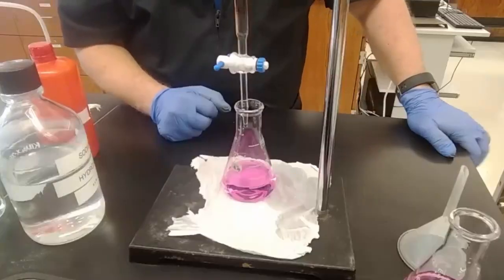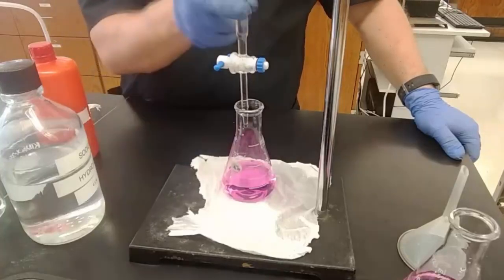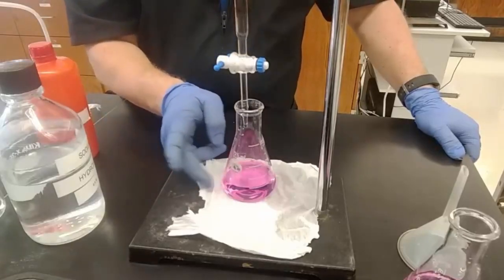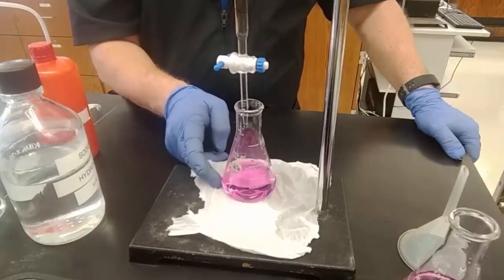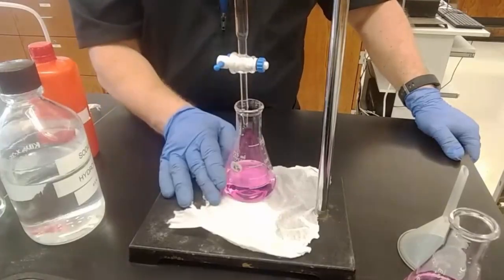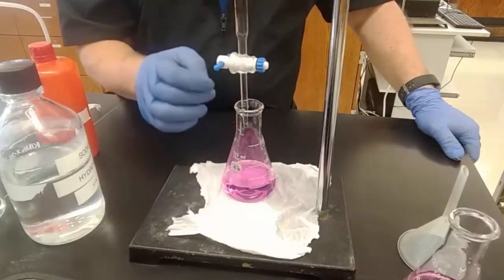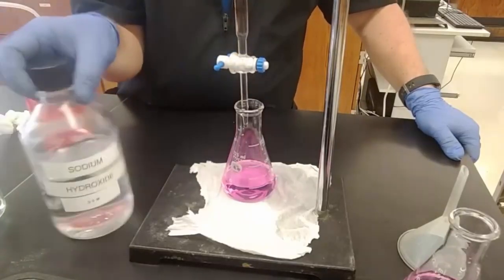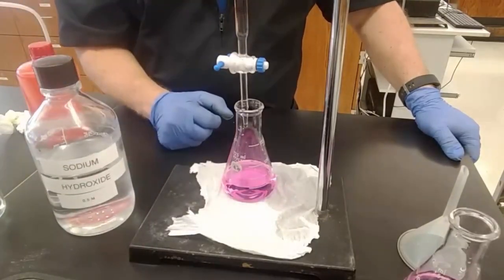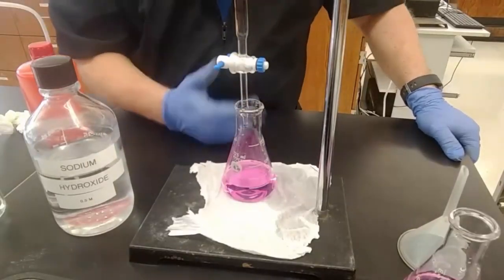Now this is going to require some additional discussion, perhaps with your instructor. But if I have too much base added, then it would appear that there's more acid in here that it reacted with, right? Let's use round numbers: say it takes 20 milliliters of base to react with the acid, but I added extra, I missed it, and it was only supposed to be 19. Well, the molarity, 0.5 molar, times the 20 milliliters is going to give me a certain number of moles, versus the molarity times 19 milliliters that it should have been, which is going to be a lesser number of moles.